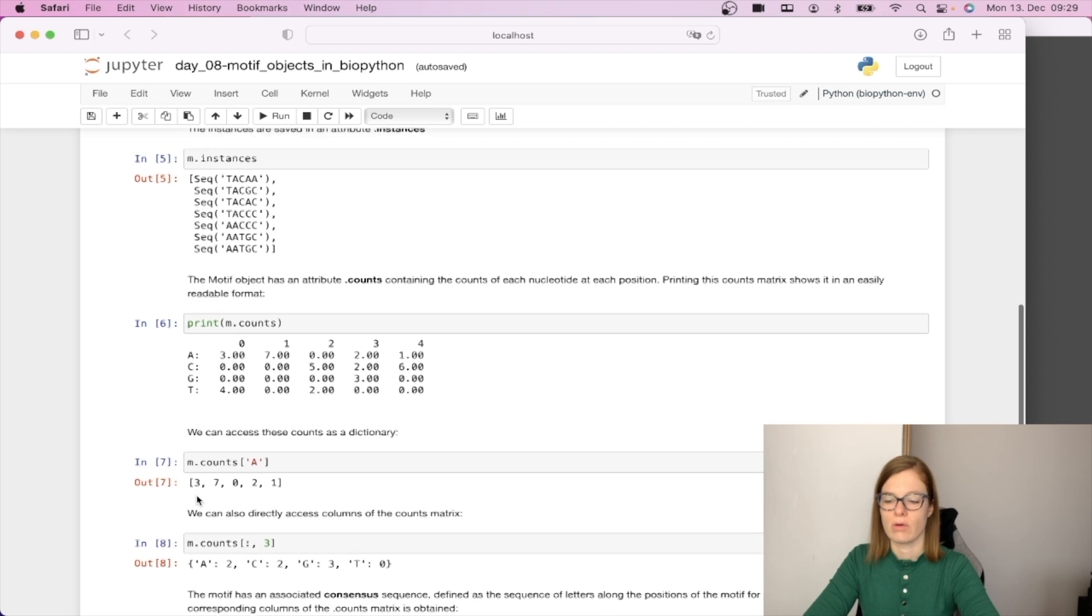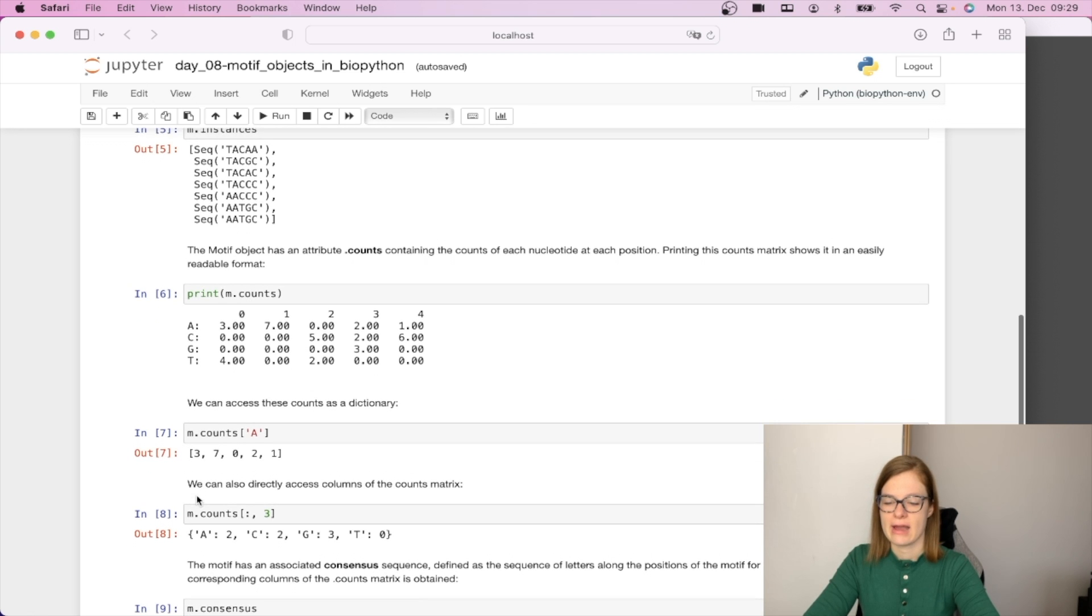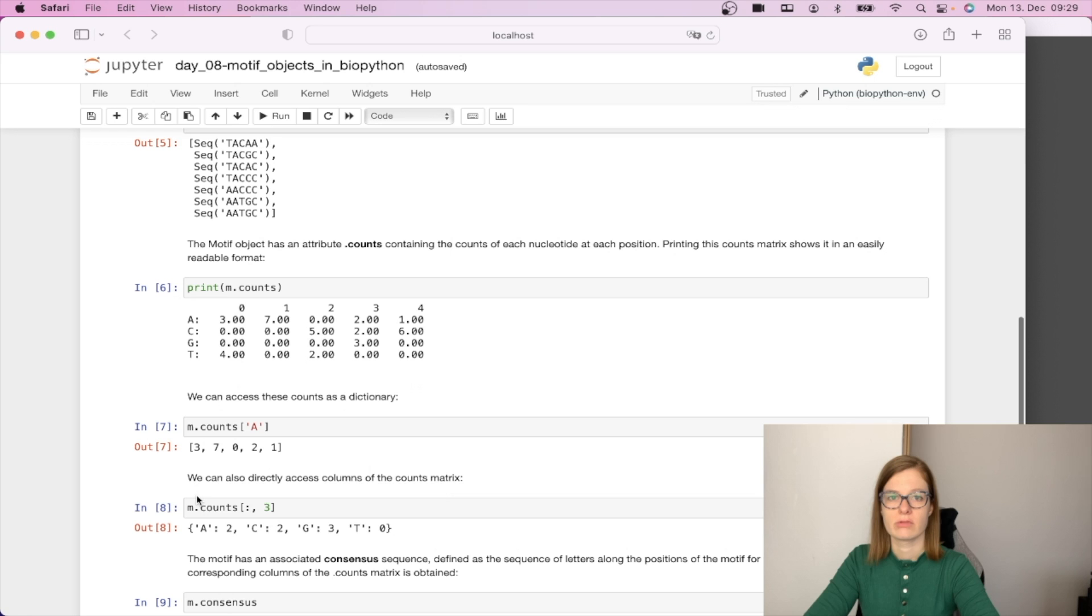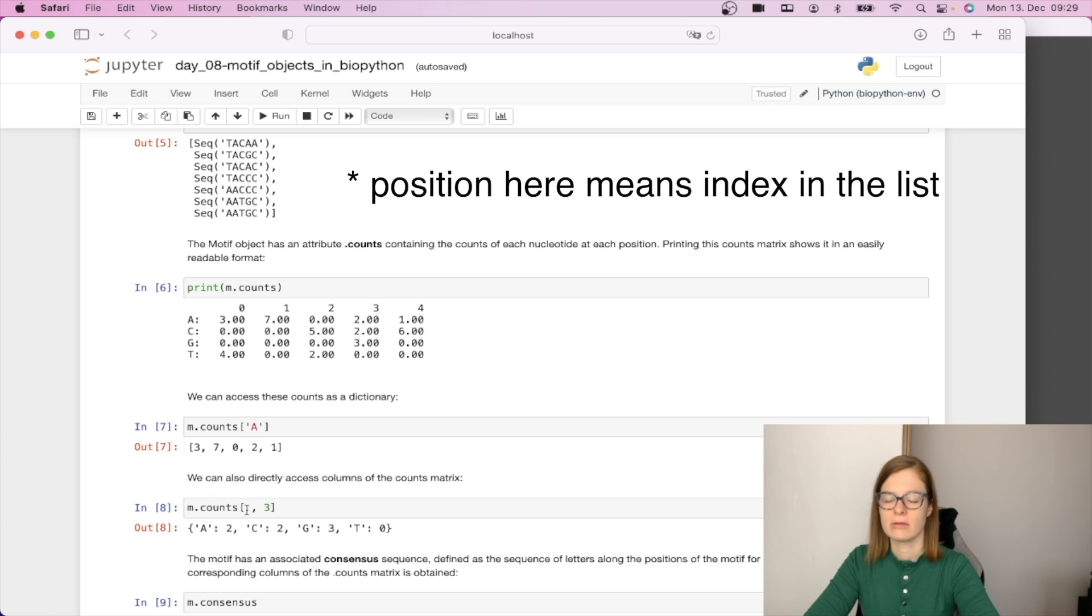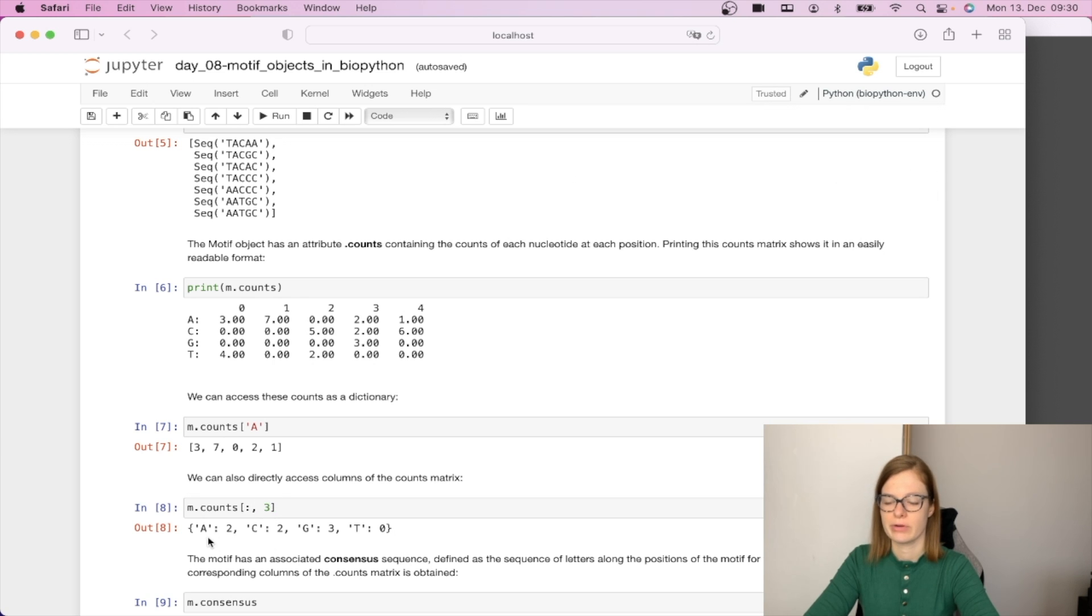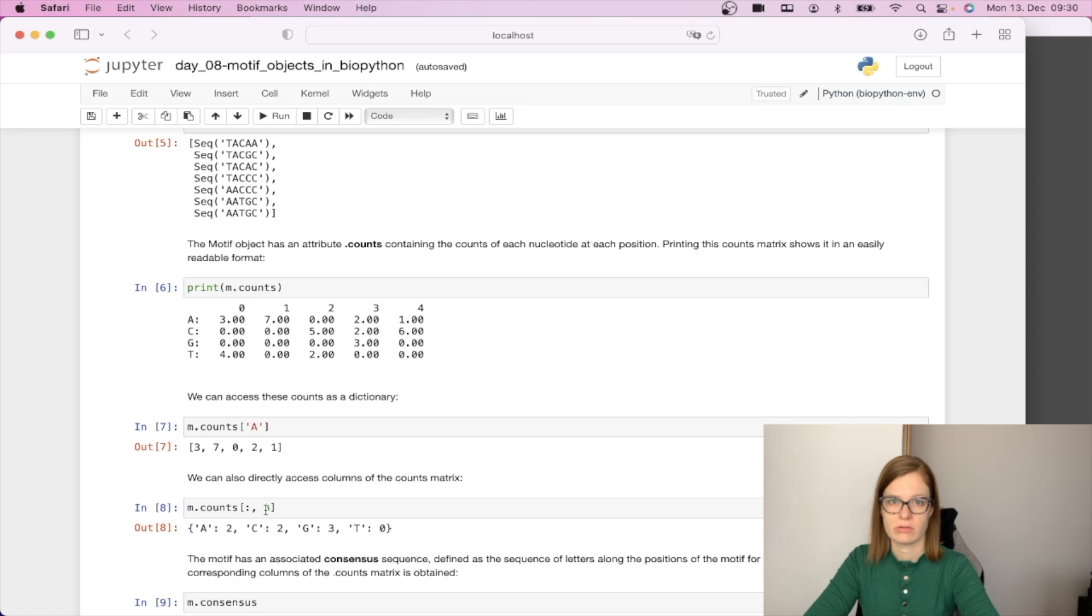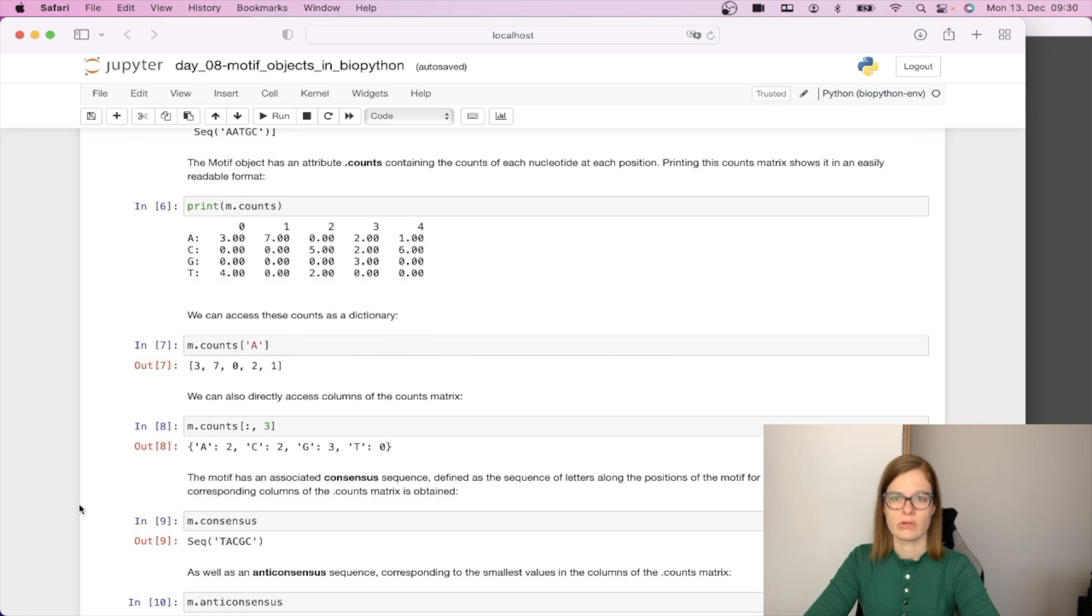We can also directly access the columns of the counts metric. For example if we would like to check everything that was on position three, you can access it by calling m.counts colon meaning all rows for the third position. This will give us per nucleotide the number of occurrences on position three.